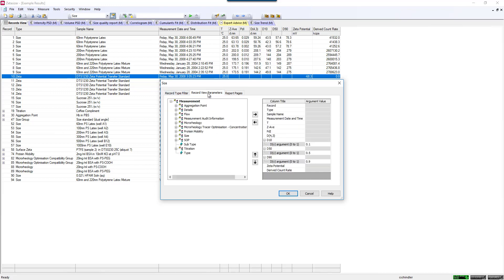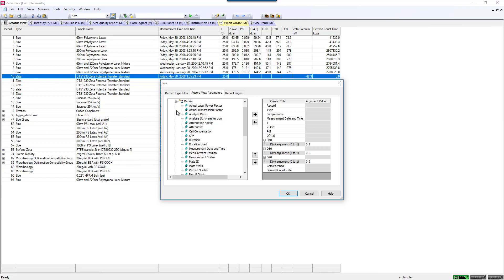The next tab is where I'm choosing what parameters I would like to display and in what order I would like to display them in. There's a whole host of many different types of display parameters that you can choose from, and you can look through these and see what makes sense for you. I'll point out a few of them that I really like for sizing measurements, which include the attenuator setting, which will tell me how much do I have to attenuate the laser for this sample, which gives me an indication of is this really dilute or really concentrated for the instrument.